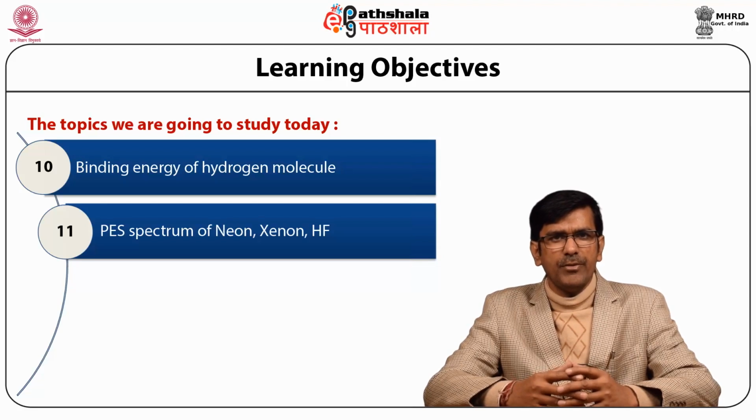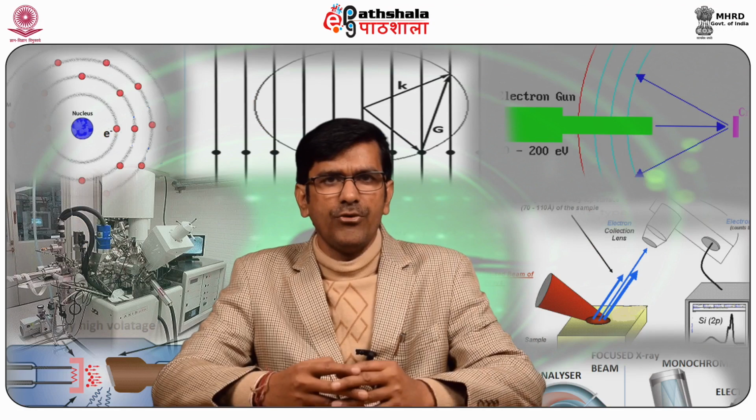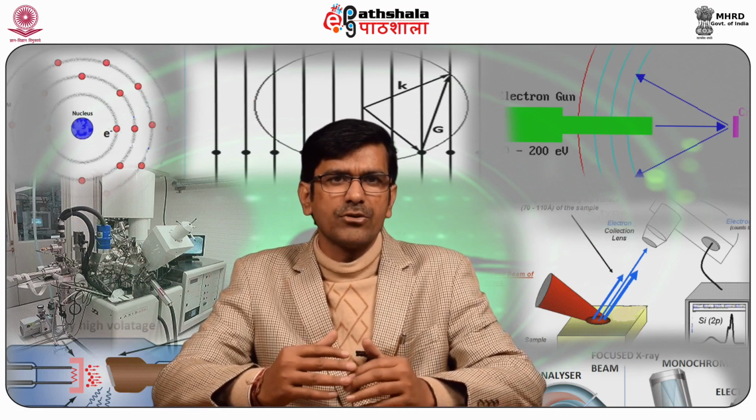At the 12th point, we will be discussing the guidelines for the interpretation of spectra from free molecules, and the 13th is the newer developments. Before the interpretation of data, we will study what is a photoelectron spectrum.